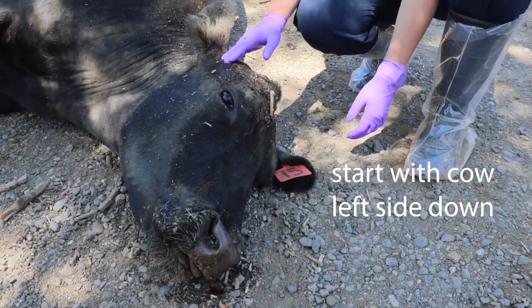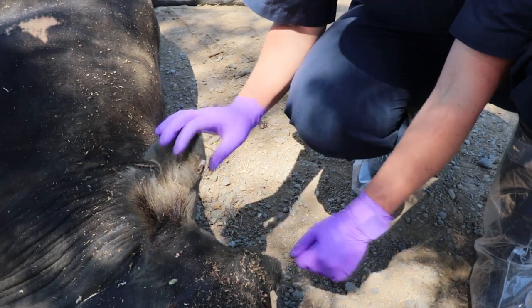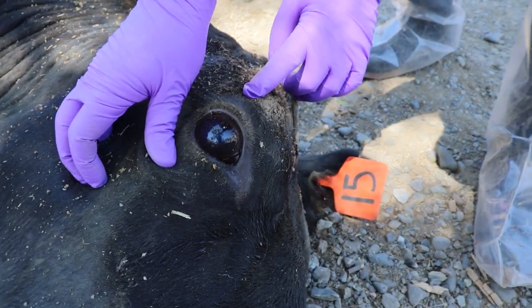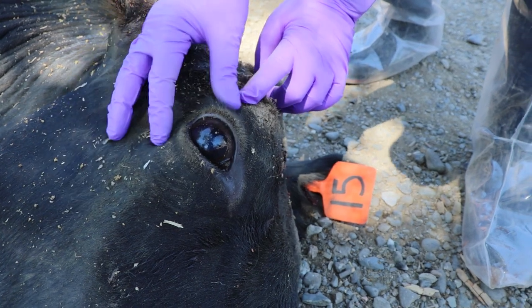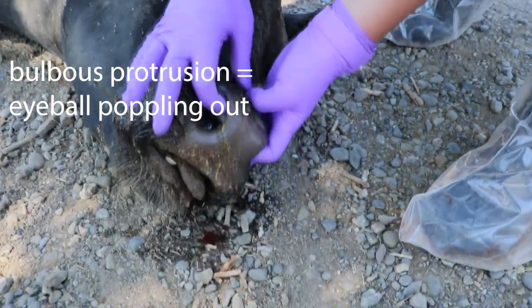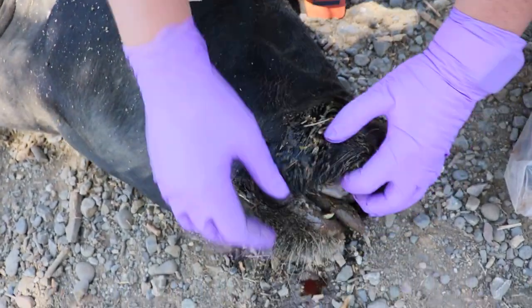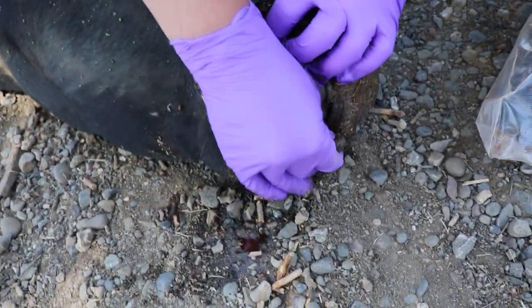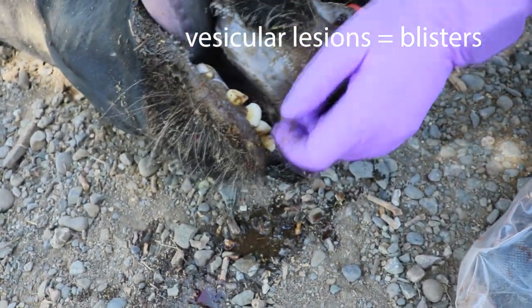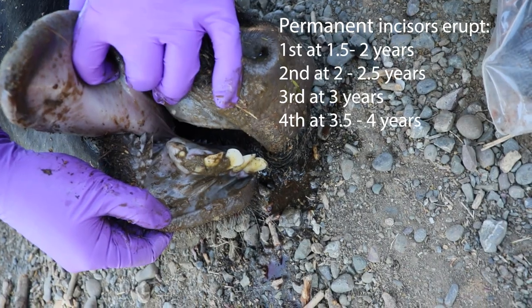First, we start with a physical examination. You can begin at the head, checking the ear tag number as well as any other tags they may have. Working over to checking the eyes for any potential ulcers or swelling that may be causing bulbous protrusion of the eye. Make sure to also check your nasal cavities for any discharge, as well as the oral cavity for any vesicular lesions. This is also a good opportunity to age the animal based on the incisors.